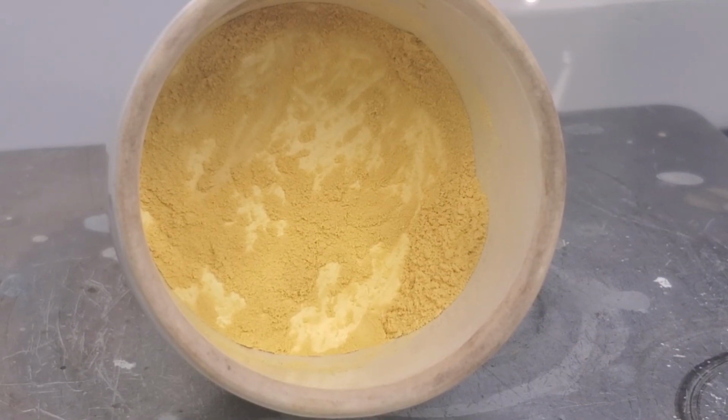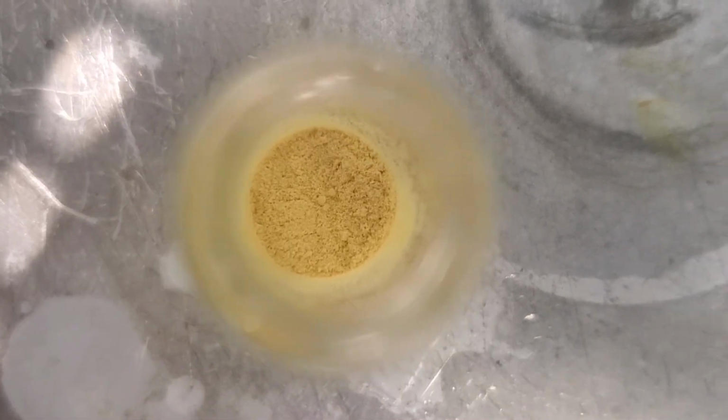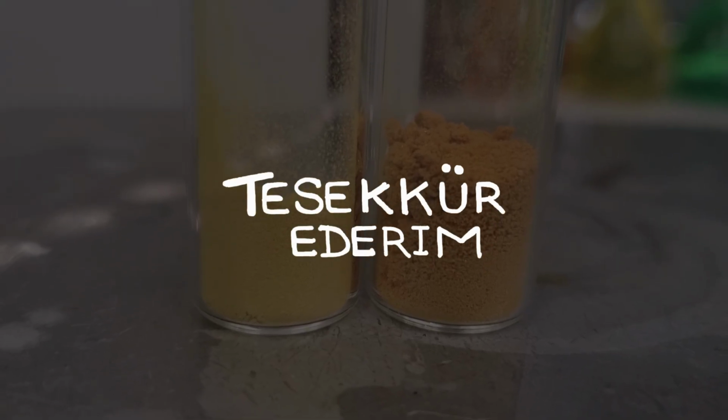Note that this powder stains quite well, so gloves are a must. Overall, the acetic acid/nitric acid method was cleaner and higher yielding, largely because it avoided the runaway exotherm of the first attempt. Thanks so much for watching.